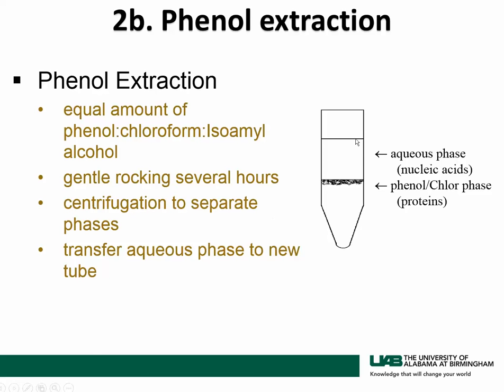So the top layer consists of the aqueous layer. This is the aqueous layer, which contains nucleic acids, that is DNA and RNA, and the interface consists of denatured protein. Okay, there's a cloudy band as the interface, which is denatured protein, and then lipids and carbohydrates are in the organic phase, which is on the bottom.